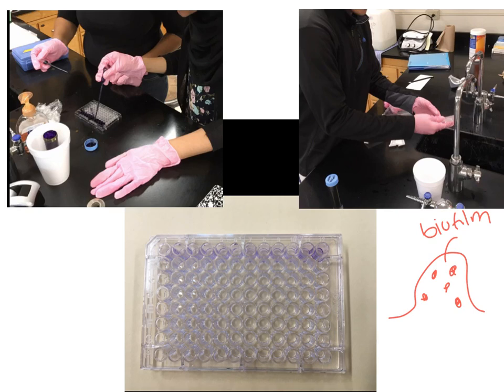Then, shown in this top left picture, we fill all of the wells that we used with a dye called crystal violet. The crystal violet will then bind to any bacteria and any biofilms that are stuck to the sides of the wells. So each well is a little hole, and there might be some biofilm growth on the side of it.